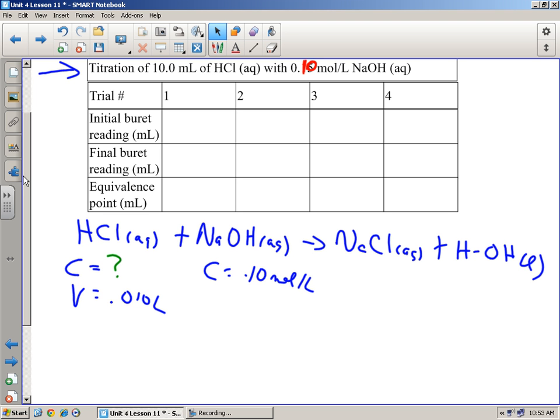So if you just start pouring like this, there's no air that gets in there, so it starts to back up, and you'll get this whole funnel filled up with sodium hydroxide. And it's going to start pouring into here, and you're going to keep pouring and pouring, and it's going to get closer and closer to the top, but this is still going to be full, and that's bad, because at some point it's going to leak out. And usually when it leaks out, it makes a huge mess.